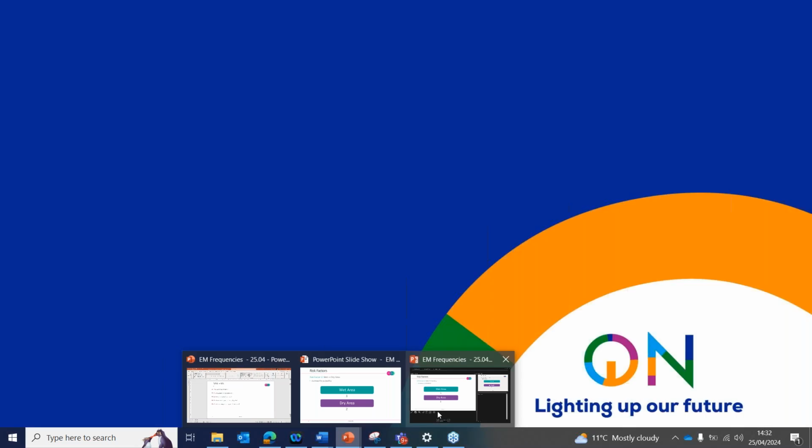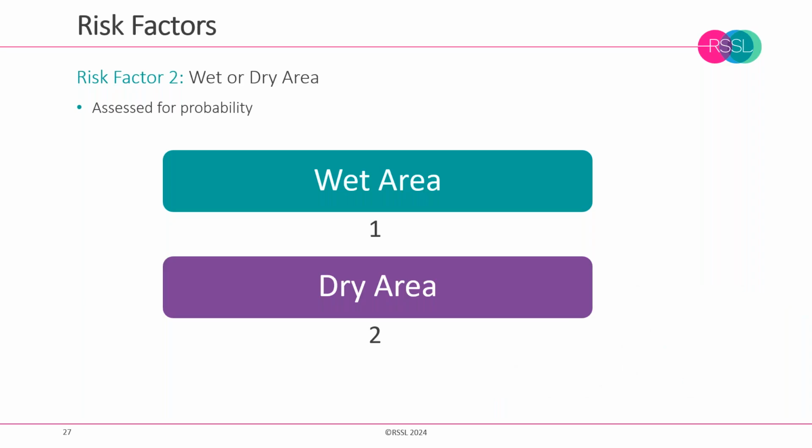With that, a wet area always presents a greater risk because water is a vector and growth source for microorganisms. The drier the area, you're going to get some organisms that will naturally desiccate, and it's also going to reduce that variety or diversity of different microorganisms that could be found.